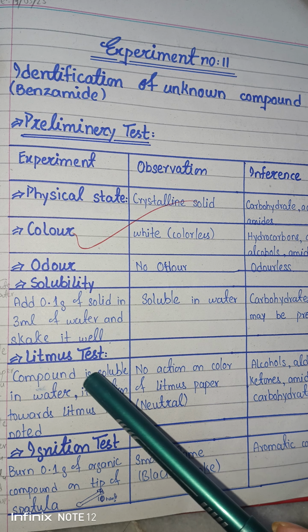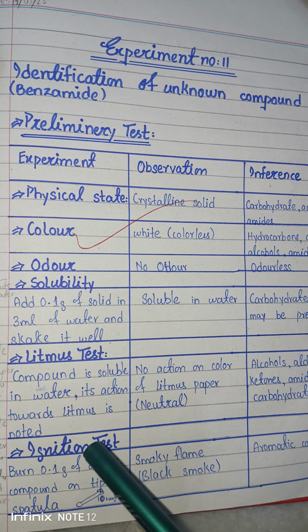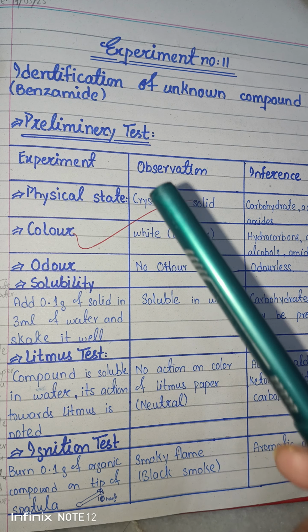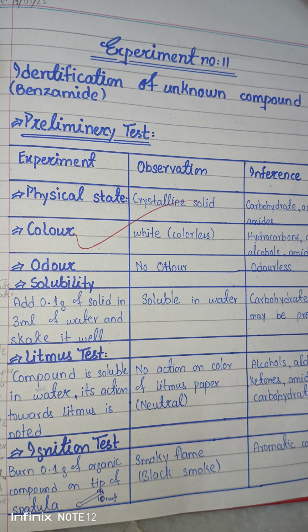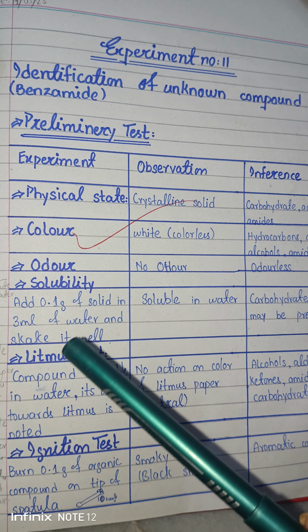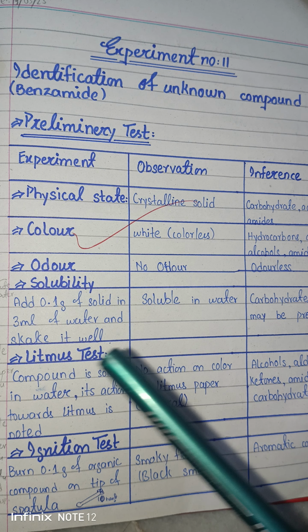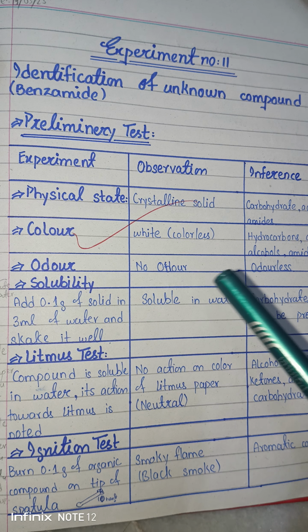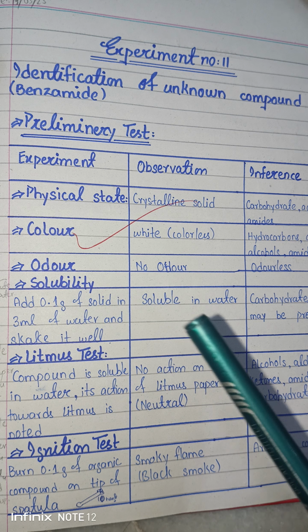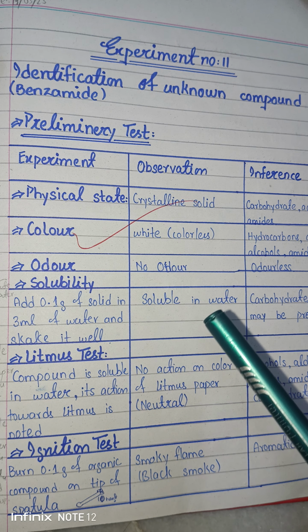Now we perform another test which is called the litmus test. The litmus test consists of a litmus paper, and we prepare the solution of this compound and drop it onto the litmus paper, and note the color change. If the color changes from red to blue, it means it is basic, and if the color changes from blue to red, it means it is an acid. In that way, we can identify whether the compound is acidic or basic.